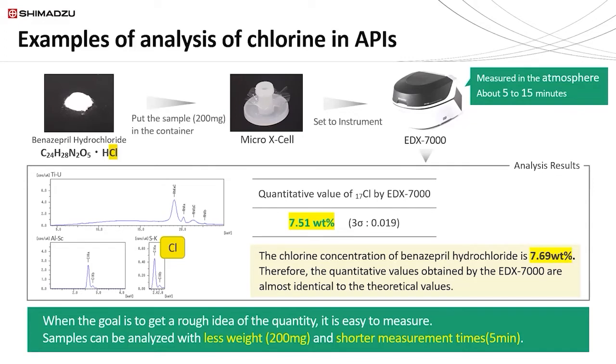And this method of quantification is called the fundamental parameter method. There are some intricacies to it, and it involves a little bit of math like matrix algebra, the mathematics of normalization, and an algorithm. But all of that comes as standard with the EDX7000 software. So fundamental parameters can easily be used to quantify data using Shimadzu's EDX7000 system.